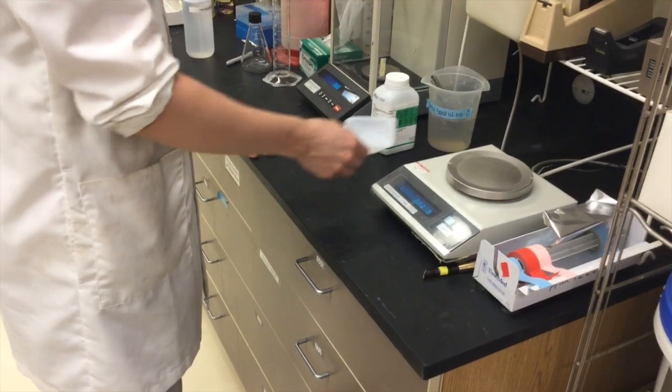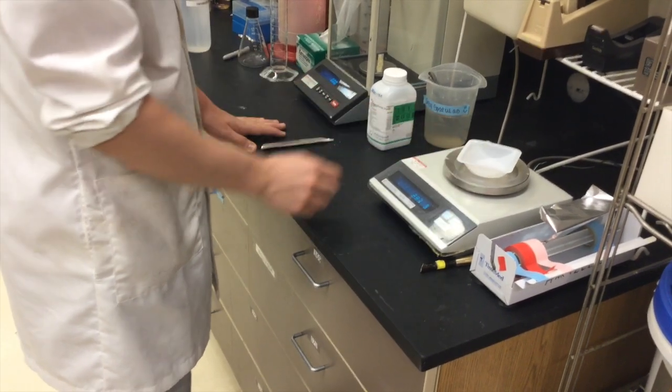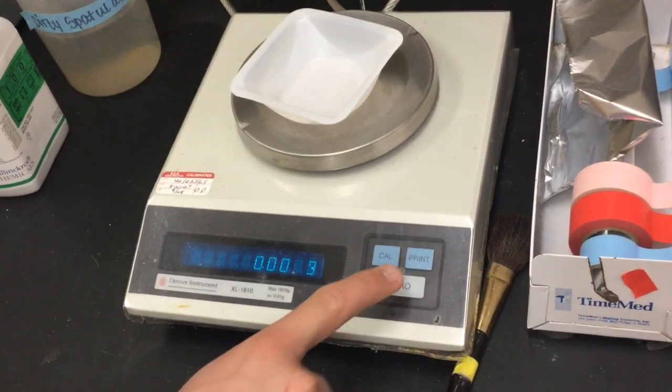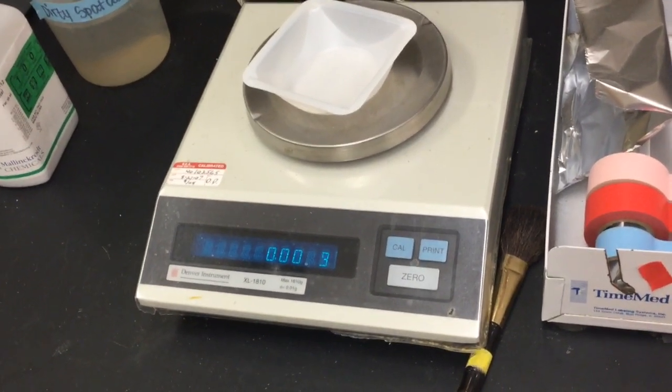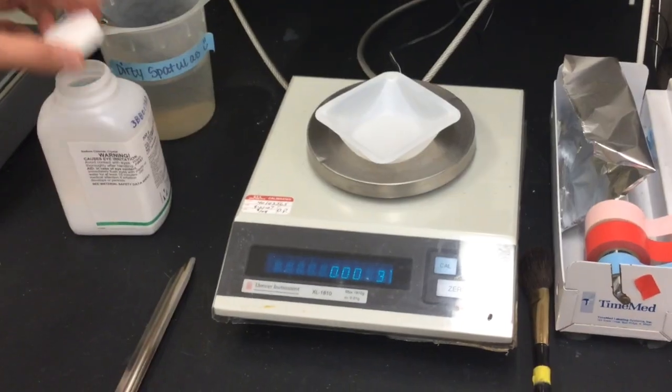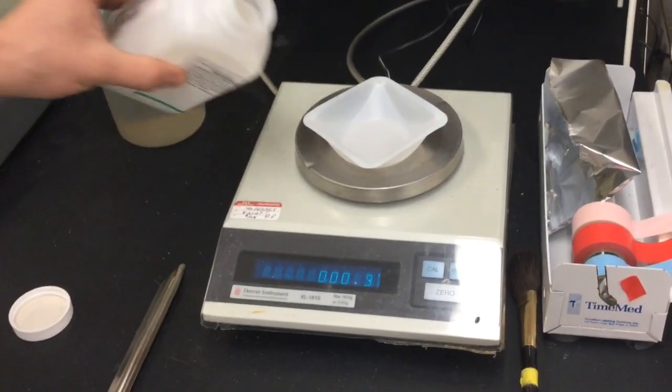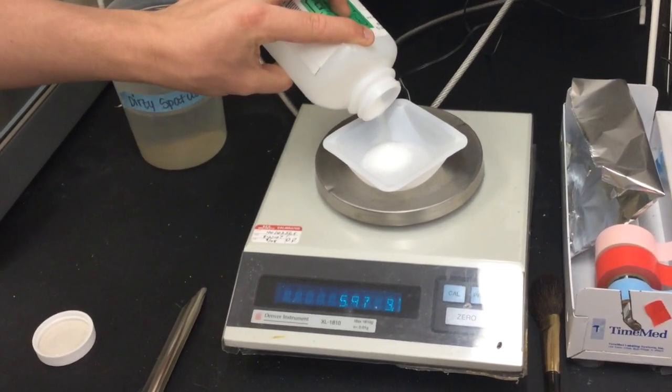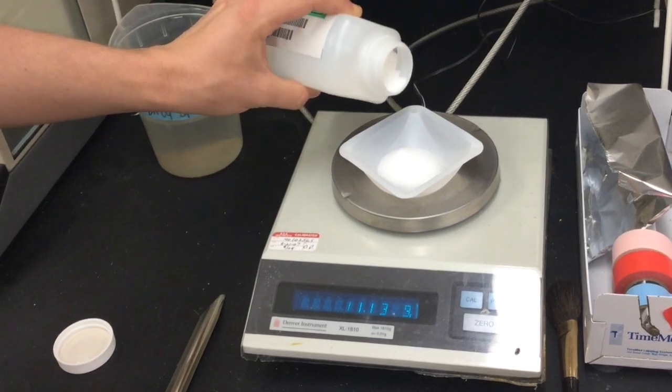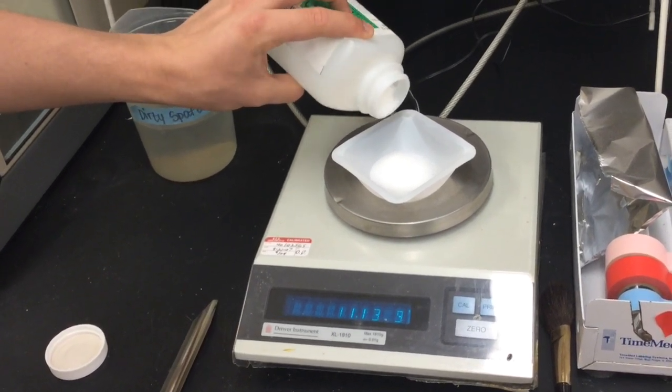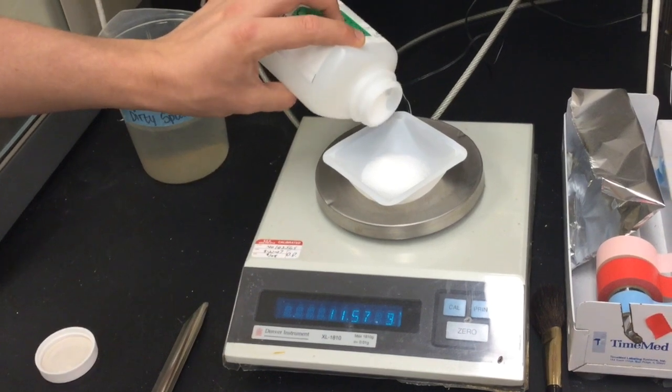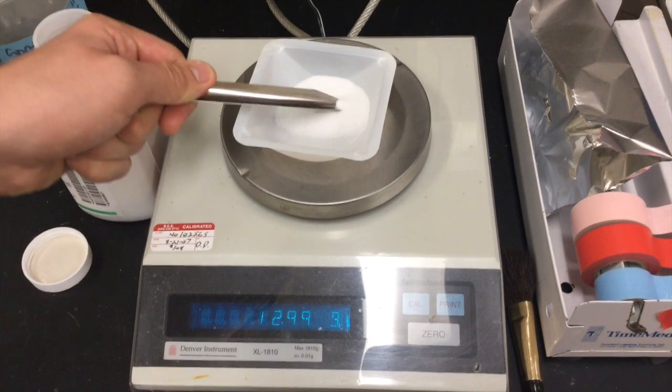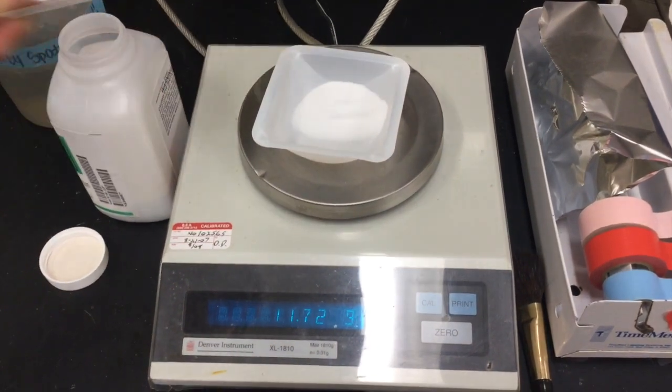First, place the empty container to be used to measure the compound onto the scale. Then click tear, or in this case, zero. This resets the scale's measurement to zero so that this container is not included in the measurement. Carefully pour sodium chloride into the container until the scale reads 11.69 grams.